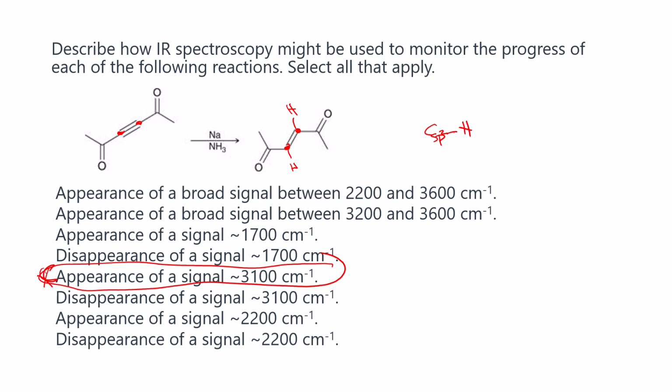Now, what is interesting in this compound is that because it is trans, and here you will have an R group with an electron withdrawing, the point is that here we will have a zero dipole moment. That will affect mostly this band, since this carbon-carbon double bond is in about the same region, at about 1600, and I don't see that listed here. In the case of the cis, it's probably seen, but here it will not be seen due to cancellation of the dipole moment. So that's a main change that I should be observing for this.